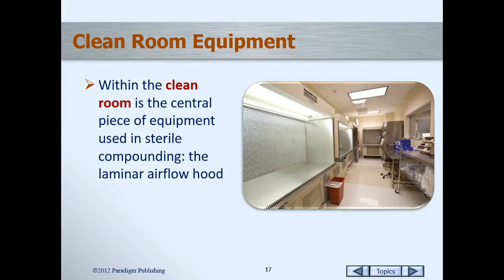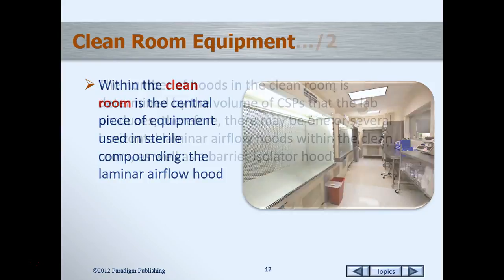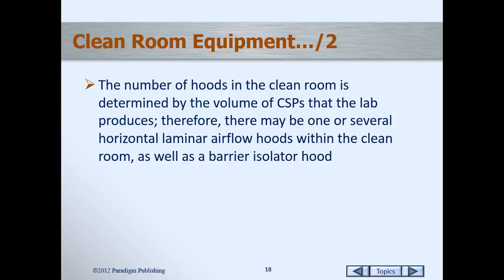Next we're going to talk about the clean room equipment. We've done our prep work and we're ready to go into the clean room and start preparing our laminar airflow hood. That's where our primary engineering control, our PEC — the central piece of equipment — is stored, in the clean room or what we call the IV room. Depending on where you work, the number of hoods you might have depends on how large a facility you're working in and how many IVs you prepare. Of course we have one in our lab, and in some facilities you may have a barrier isolator hood.